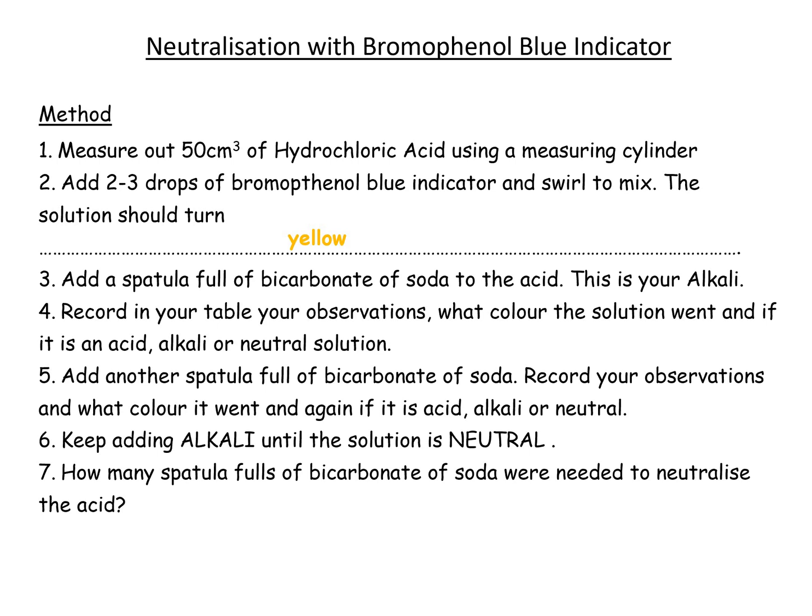This is the alkali. You're going to record your observations in a table: what colour the solution went, and if that means it's an acid, alkali or neutral solution. You're going to keep adding a spatula until a colour change is seen.